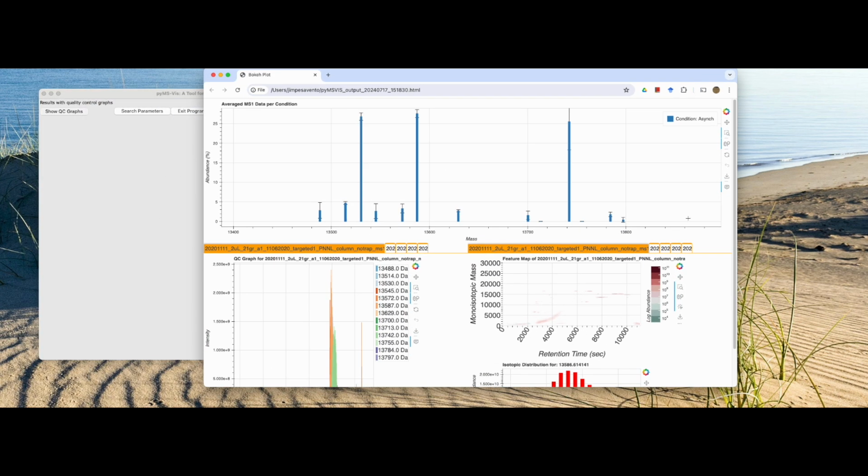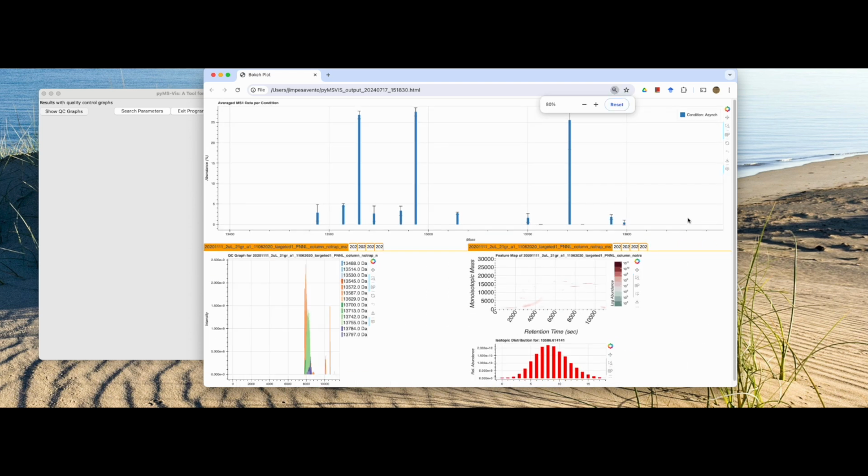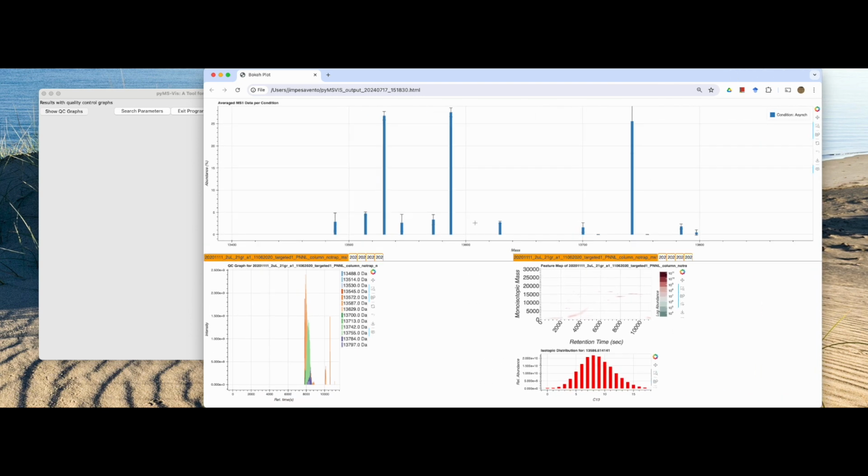all right, let's do that. Okay, so what are we looking at? Here are all the masses again that were queried. The error bars represent how much these changed in the 5 different data sets that we used, called async.